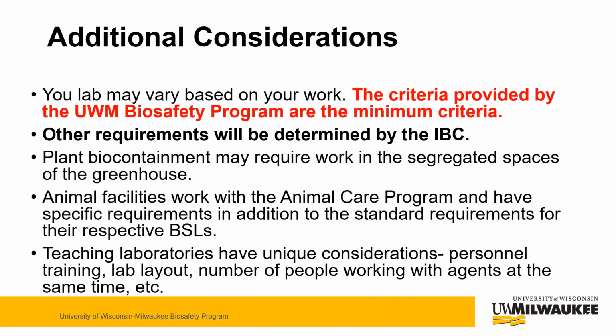Remember, your lab may vary based on the work that you do. The criteria provided in this training is the minimum criteria necessary to work in your lab. Other requirements may also be determined by the Institutional Biosafety Committee. Plant biocontainment may require work in the segregated spaces of the greenhouse.